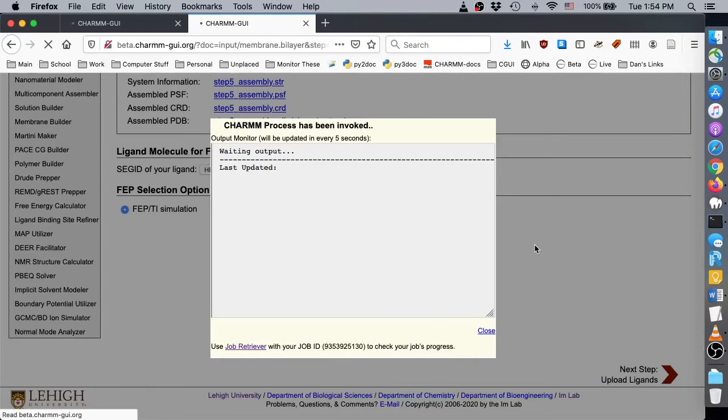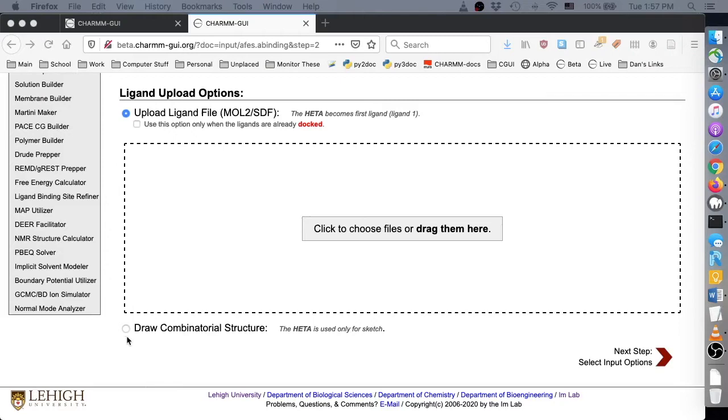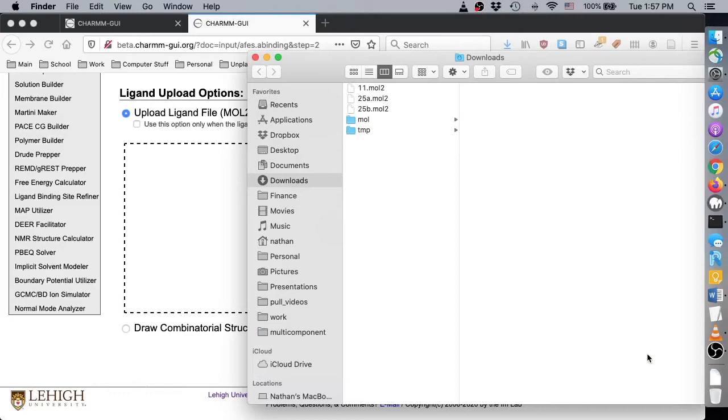Notice the options for uploading or drawing ligand structures, which you should remember from the previous videos. For this demo, we will upload three undocked multi-ligand files for the compounds named 11, 25A, and 25B.